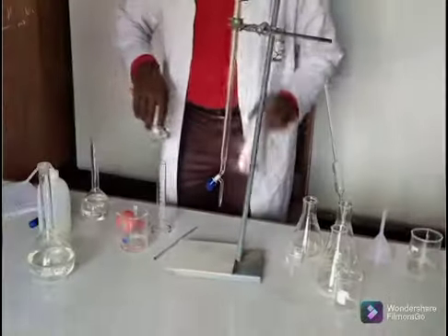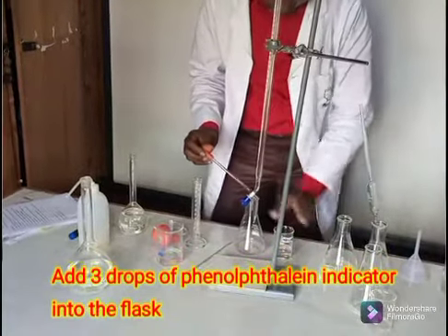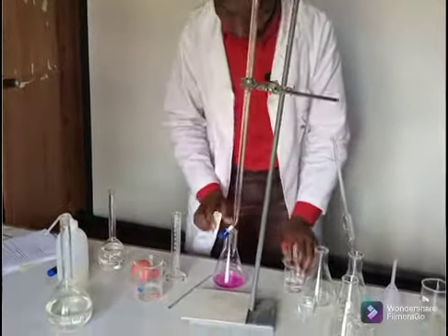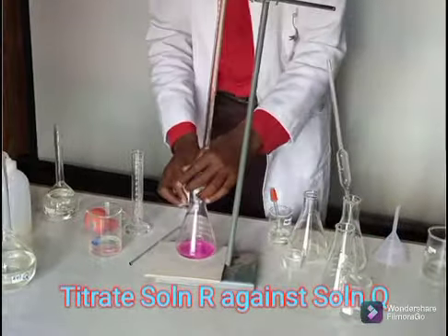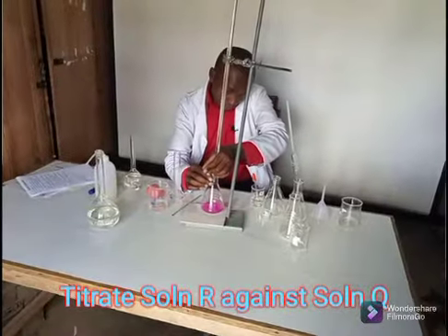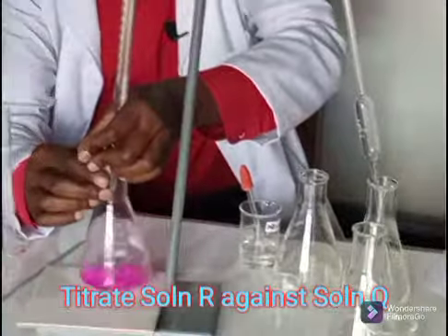In the first one, I will add 3 drops of phenolphthalein indicator. 1, 2, 3, yes, 3. So with that, I'm ready for my first trial. I'll be very careful. Remember, in the first trial I'm very, very careful, then the others will be easy.